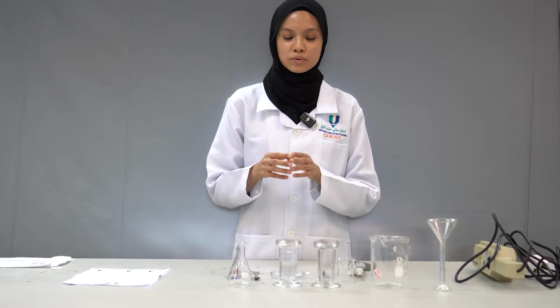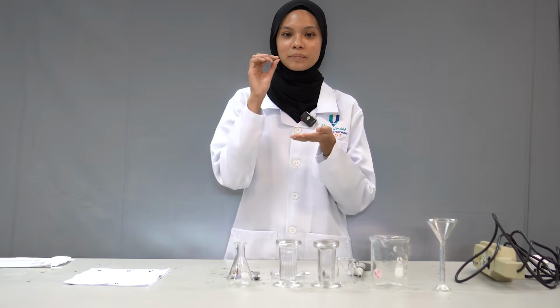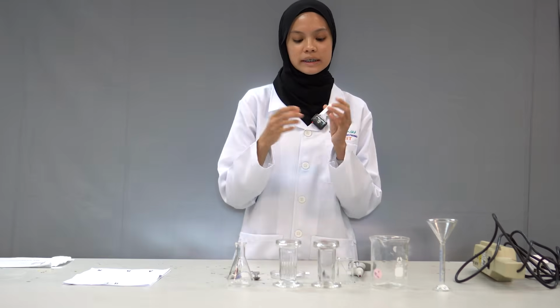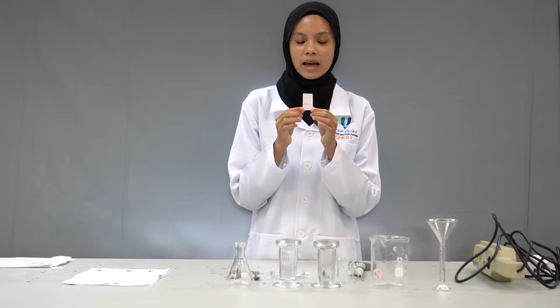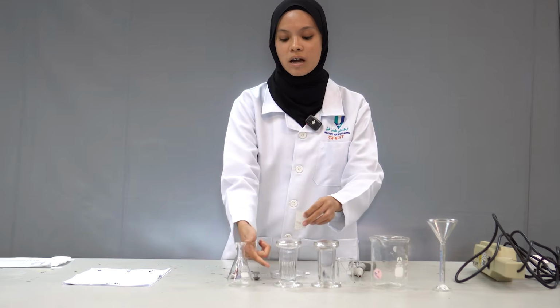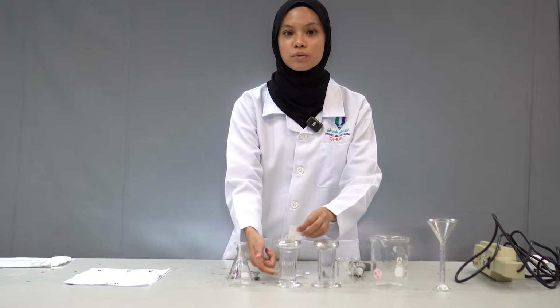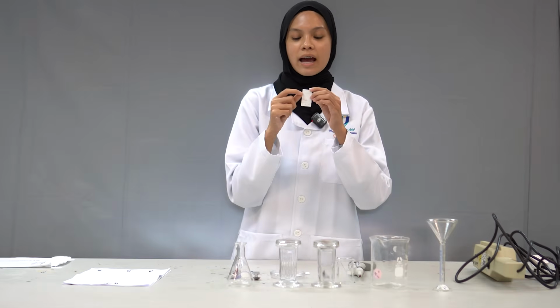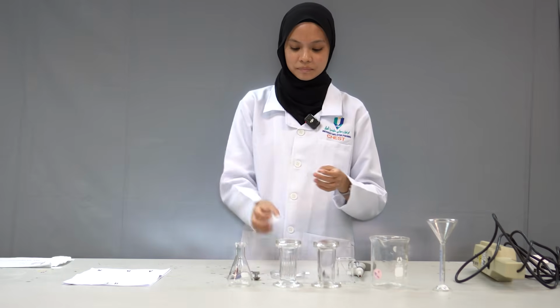We are going to use the solvent mixtures and spot the sample on the TLC plate, and then put it in the developing chamber, allowing the solvent mixtures to migrate up to the top of the plate by capillary attraction.